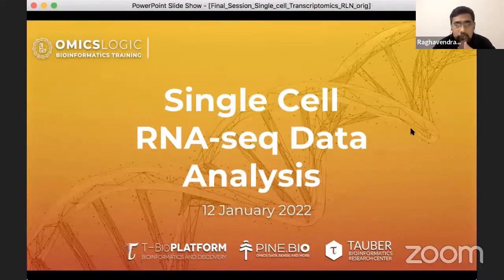So while you had already obtained a lot of introduction and information and explanation regarding single-cell RNA-seq data, single-cell RNA-seq process, let us go through all of these. This will be a very good opportunity for you also to summarize what you have grasped so far in the last 1 hour or 1.5 hours.